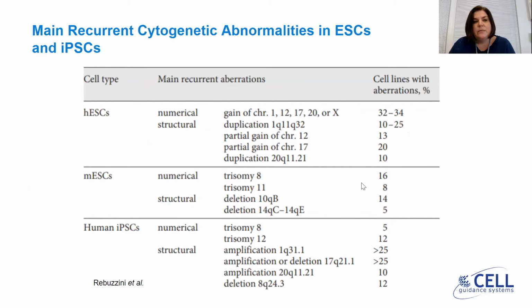We don't get a vast range of iPSC and ESC cells at CellGS because often we're repeatedly analysing the same cells after increased passage number for our customers. However, as I've shown, we do see most of the common ones.